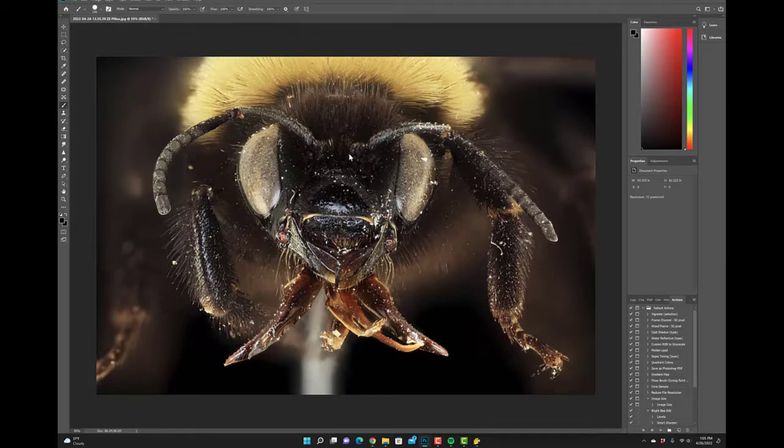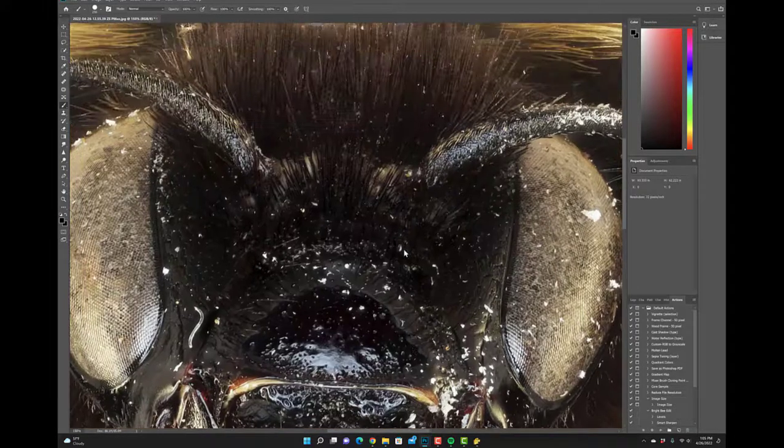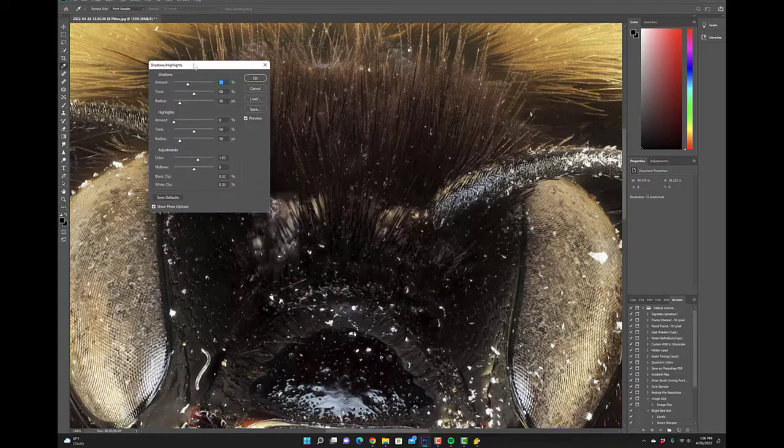Okay, now let's focus in on an area. I'm just going to pinch in with my fingers. This is touchscreen, where we do have dark on dark. So we've got all these dark black hairs contrasted right against basically a dark exoskeleton. So what we're going to do is move down to shadows and highlights.